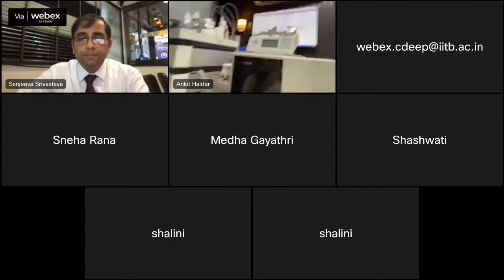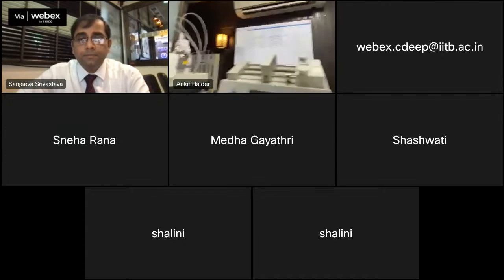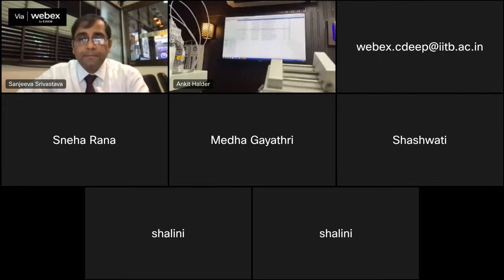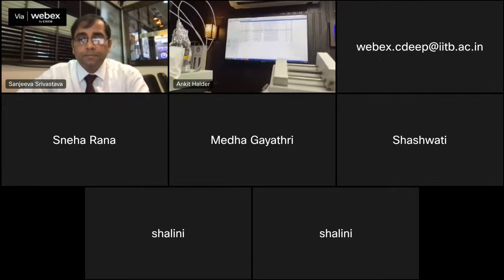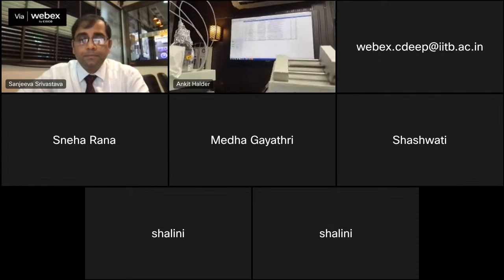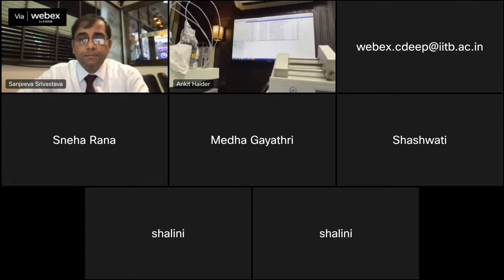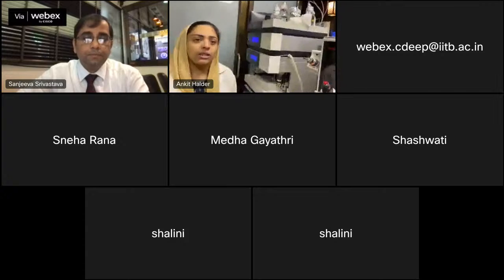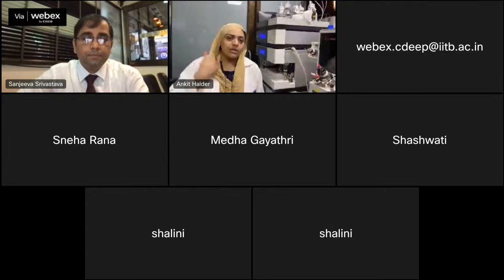So this is the software, again from Thermo itself. This is Xcalibur; as you might have probably been shown for discovery proteomics, a similar kind of software. Once we have done all the sample lineup and alignment, and we know its position and everything, then we line up the sample with some method. This method is created based on the list of target peptides using the software Skyline.